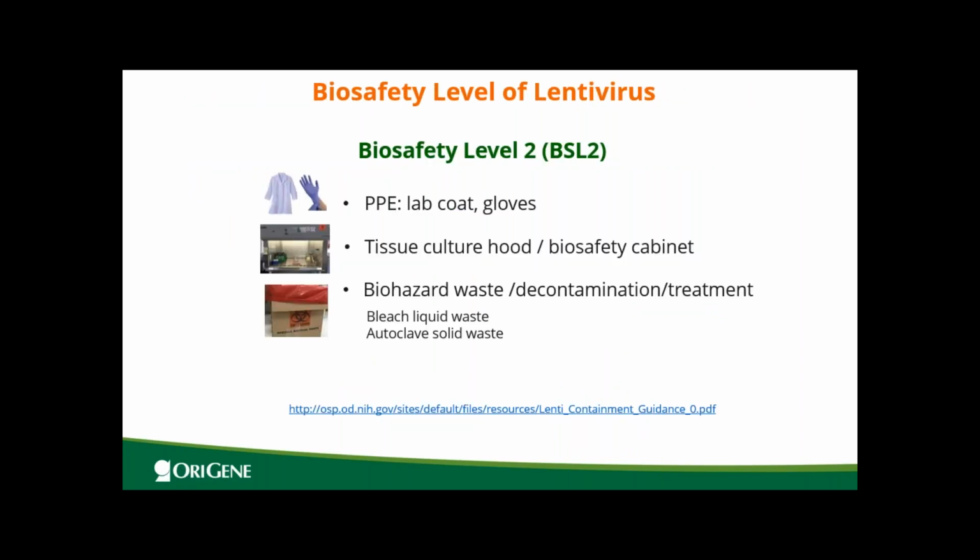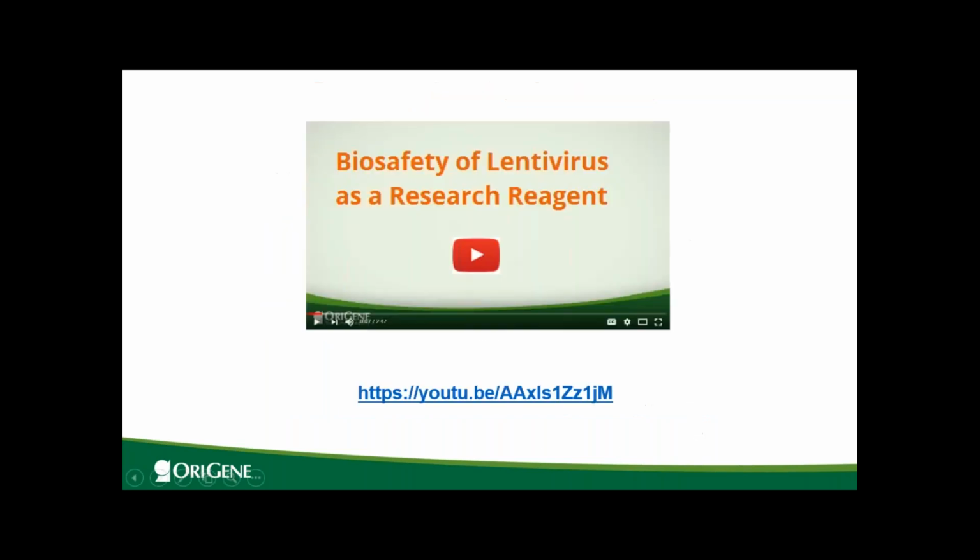However, lentivirus is still a virus, so precautions need to be followed. You will need to wear a lab coat and gloves, work in a tissue culture hood, and use bleach to decontaminate. Basically, if you know how to work with tissue culture, you know how to handle lentivirus. For the details, you can follow the NIH guideline shown here. And we also have a biosafety video if you want to know more details about the biosafety. It's posted on our Lenti page. Here is the URL on YouTube.